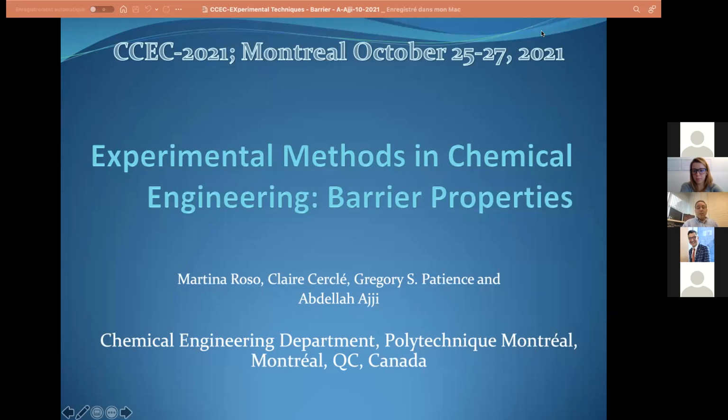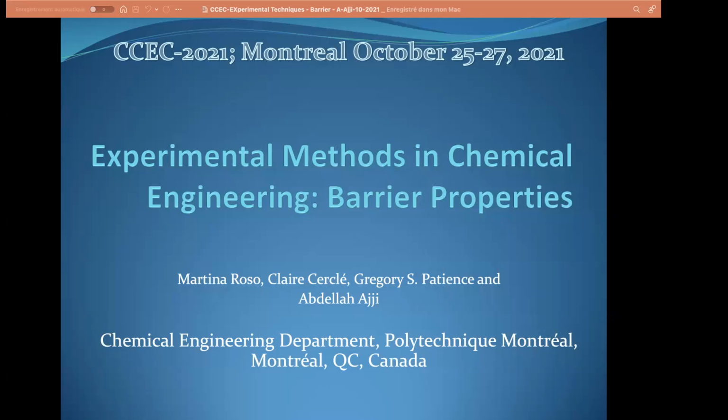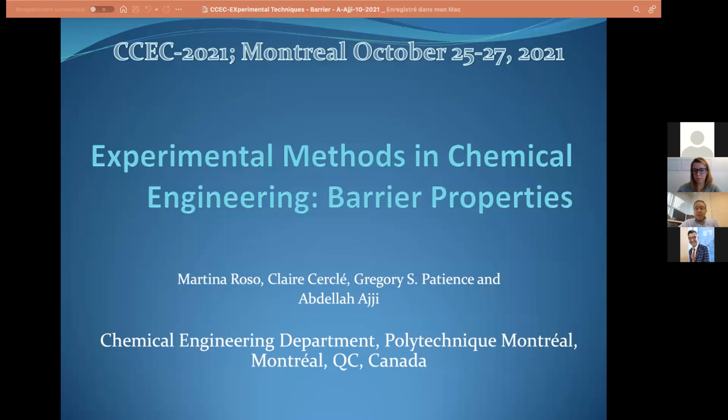So this last presentation will be on the experimental methods in chemical engineering, barrier properties. So it is about the barrier that measures permeation properties to various gases in particular.